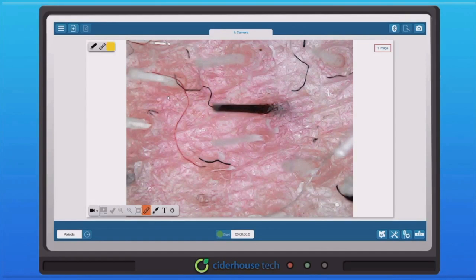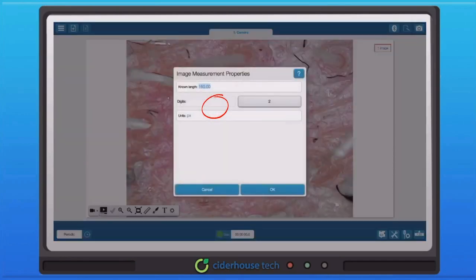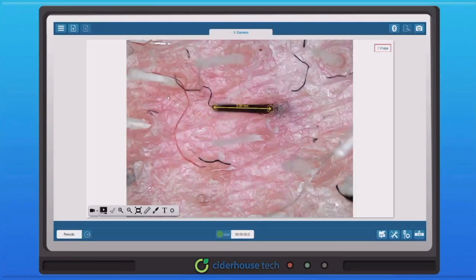Click to where you want to measure from, then drag your cursor to the end of the required measurement. If a known measurement is available, such as a slide scale, we can calibrate the ruler. To calibrate the ruler, click on the box at the start of the line. This will open the ruler settings panel. Here we can enter the known values of the measurement. Now any future measurements will be in the scale of the calibrated measurement.